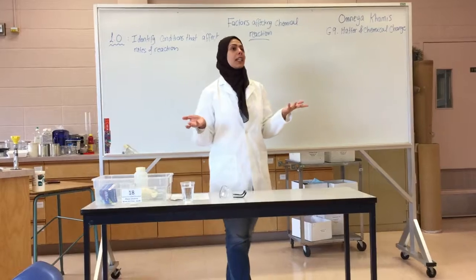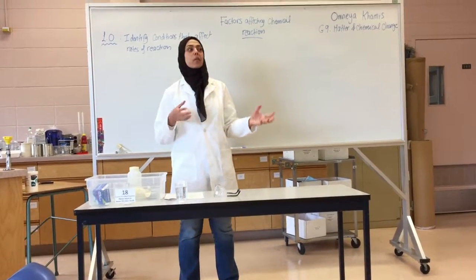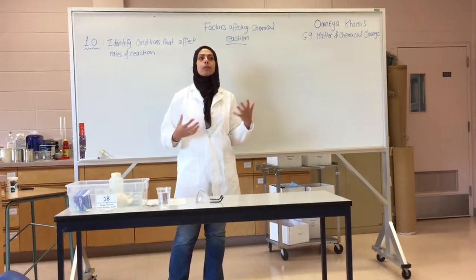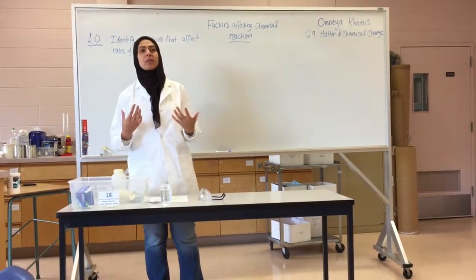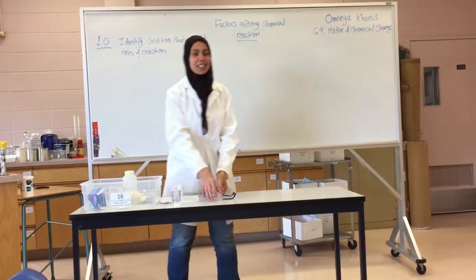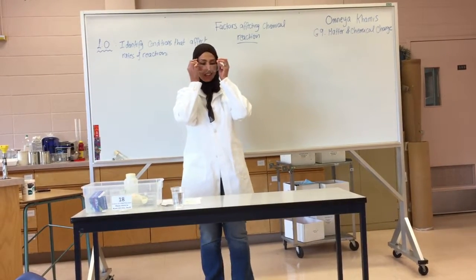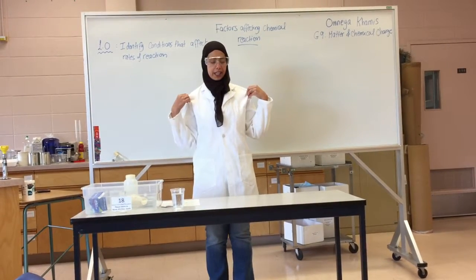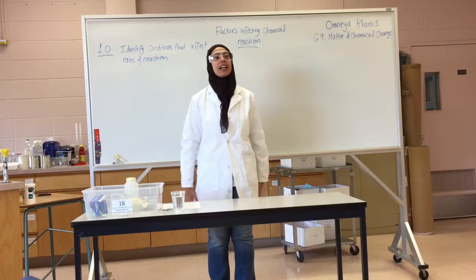Before starting anything, what lab safety rules do you remember before starting any lab? Refresh my memory. What should I do now? Put on safety goggles. Yes, so I have to put on my safety goggles. What else do I have to do? What am I wearing? I'm wearing a lab coat.